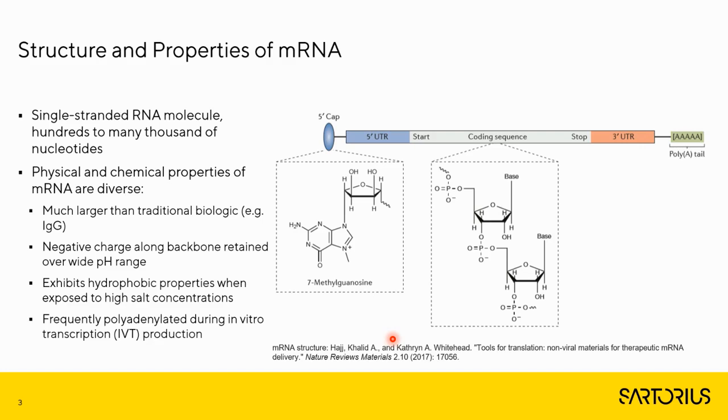Of course, also some benefits, because you can, on the basis of size, differentiate between mRNA and other molecules. And of course, this size property is even potentiated for larger RNA molecules like self-amplifying RNA, which is nearly an order of magnitude larger still.